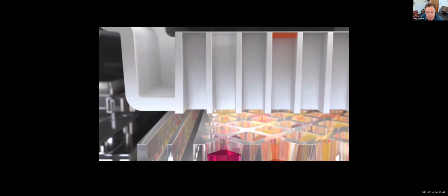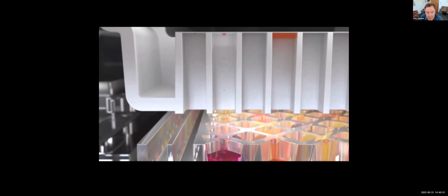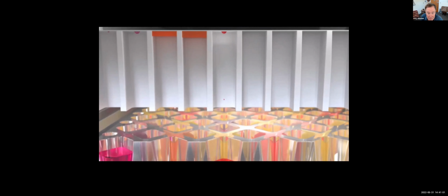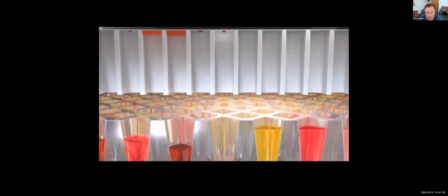This is 1 nanoliter. We can put hundreds or thousands of nanoliters into one spot, and we can mix and match different wells. So it's a fairly streamlined process, and it really facilitates what we're doing, with hundreds of thousands of molecules analyzed over a period of years. This has turned out to be the key technology.